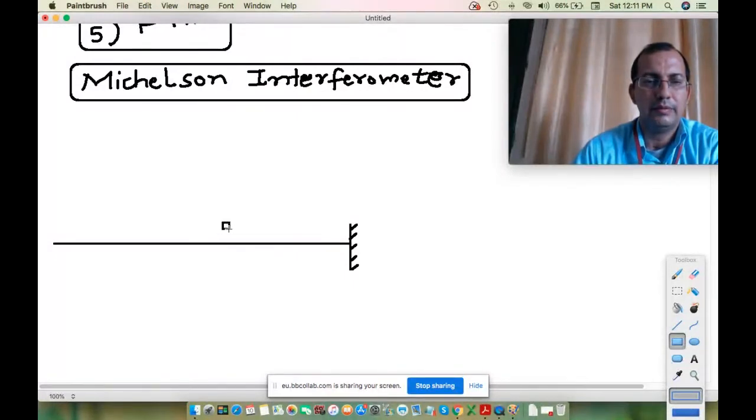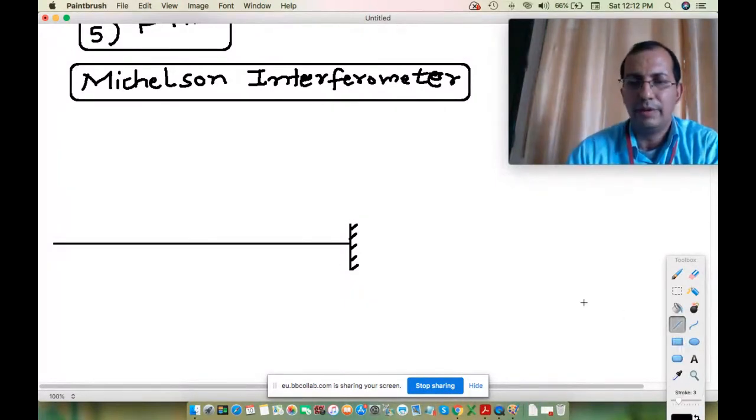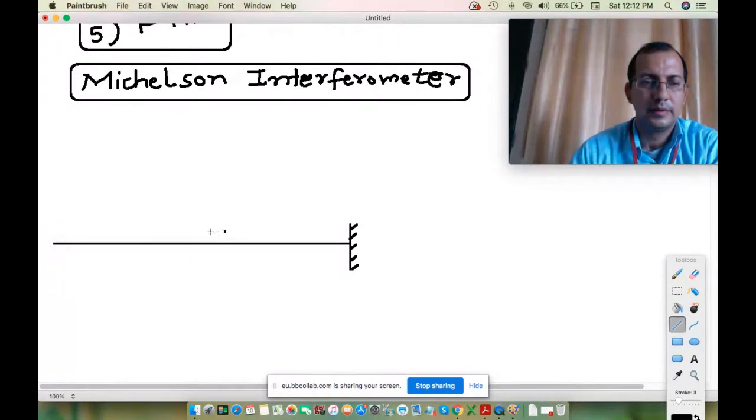So you would have a beam splitter, let's say somewhere here.